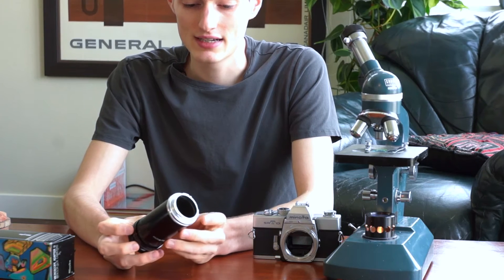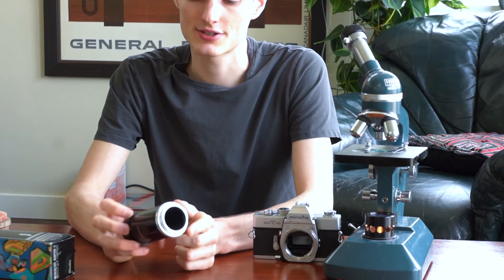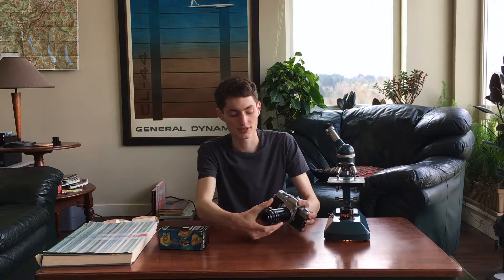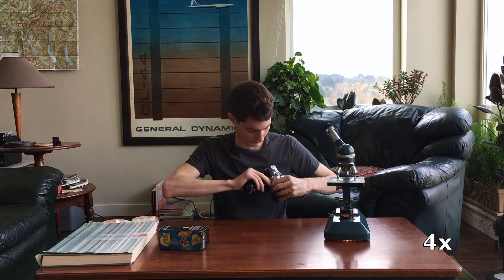Let's take a quick look at the adapter itself in a little more detail. On one side, the silver side, that's the part that goes onto the camera — this is the SR mount section. There's a little red dot that indicates where it mounts, and you can just stick it onto the camera and lock it in place just like you would a normal Minolta lens. The top section does also screw off, but in most cases you just want to leave it on.